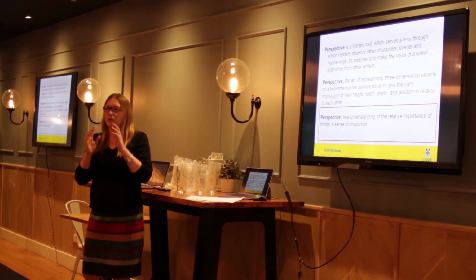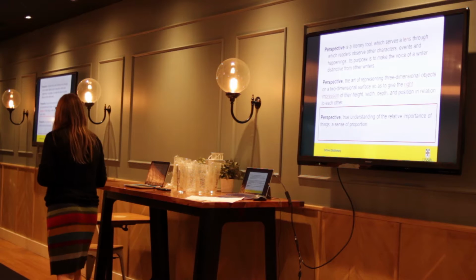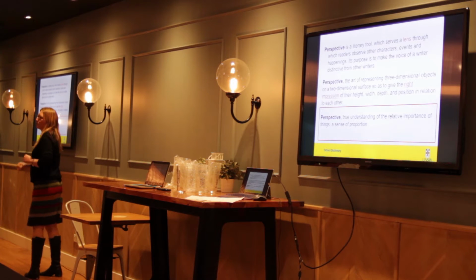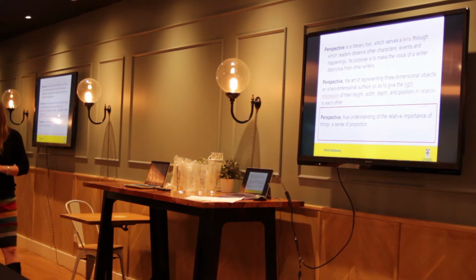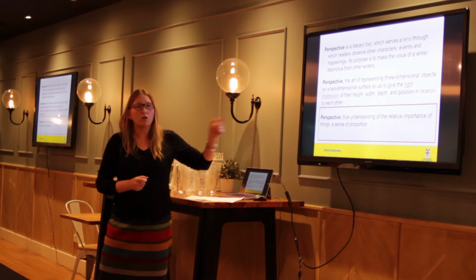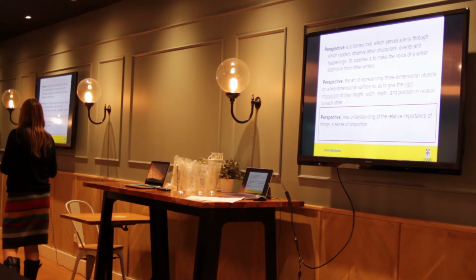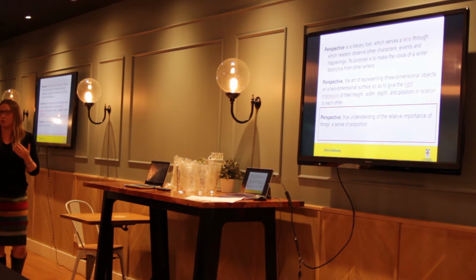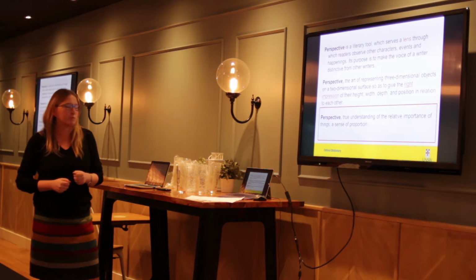So I want to come back to perspective because I want to finish with this, because there are a couple of last things I want to talk to you about. The first thing is I want to go back and talk about what the right impression is that you get from microscopy data. Just because you see, do you believe? Is that what you should be doing? And of course, perspective, in its final form, true understanding of the relative importance of things, the sense of proportion. Now, to me as a scientist, that means quantification. And yes, microscopy is for quantification, as well as it being for beauty.